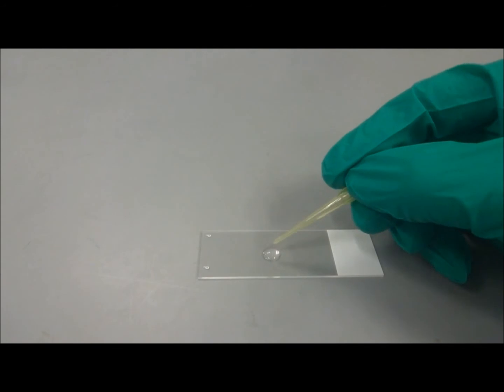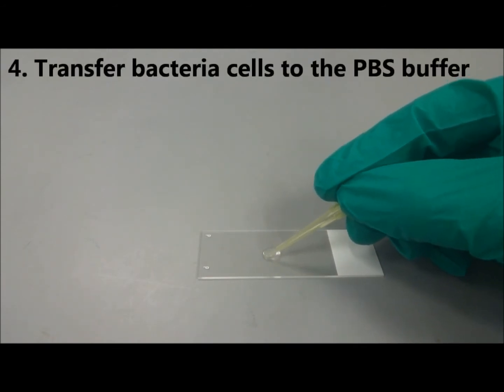Touch the drop of PBS with the pipette tip. Move the tip in a circular motion to transfer the bacterial cells to the PBS buffer.